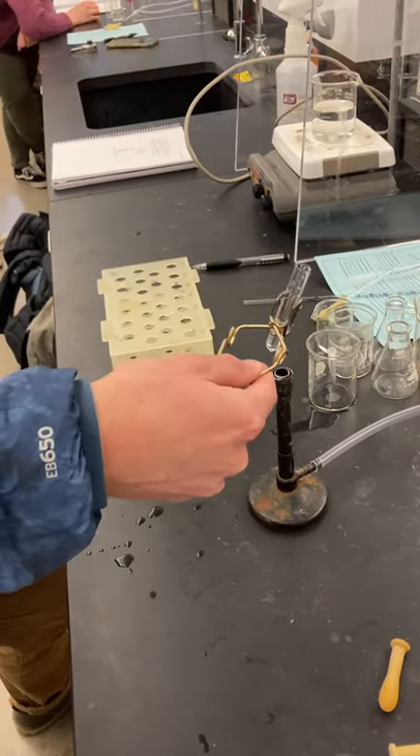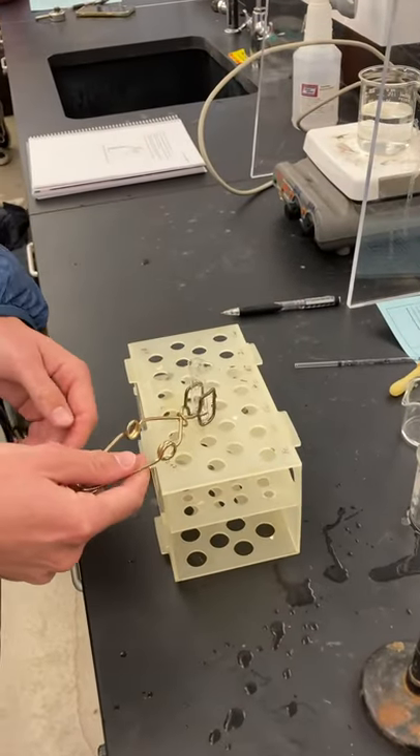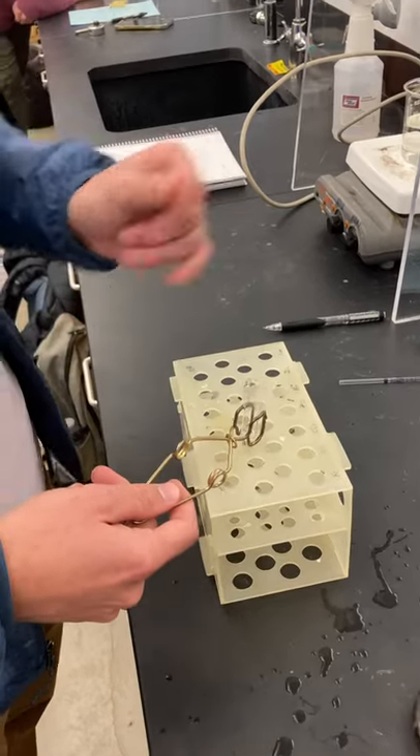And once you're done heating it, moving it around like so, take it to your rack to cool. Place it right there. And once it's cool, then you'll be able to remove it and touch it with your hands.